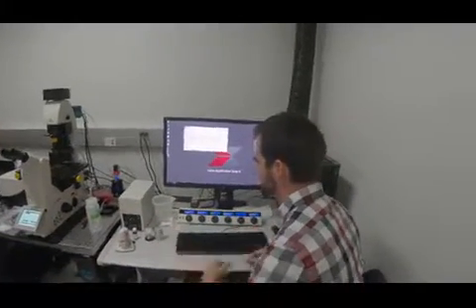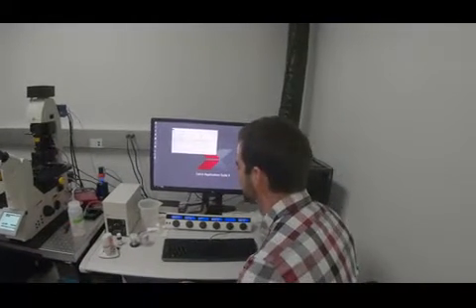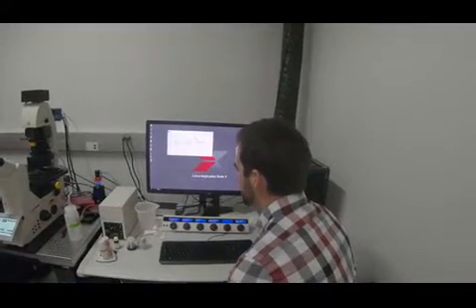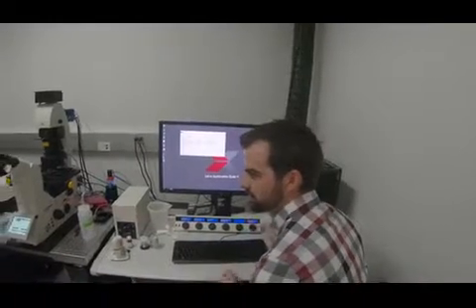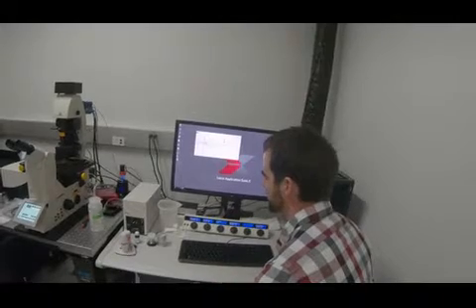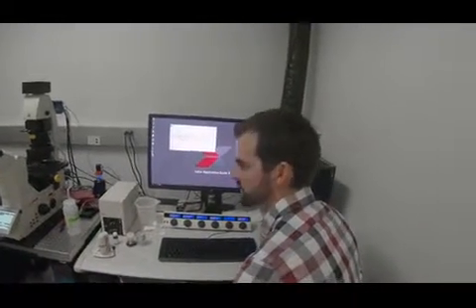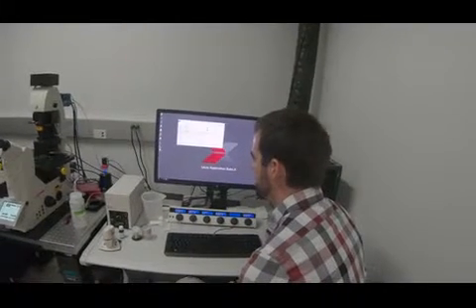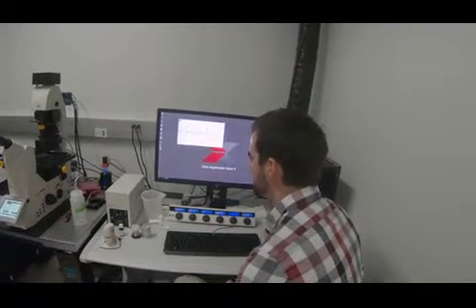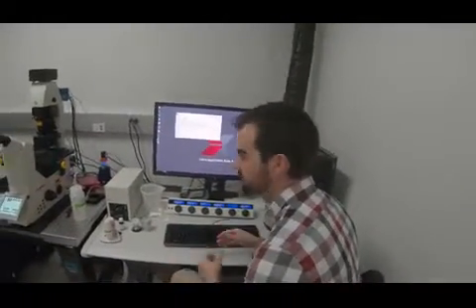Those are just normal spinning disk hard drives. That's your data stored. It's pretty fast because it is a RAID 5 array. The system, OS, everything is on its own single solid state drive, so don't save anything here. And then the temp drive, also don't save anything here. These are two solid state drives in RAID 0, so they're striped.